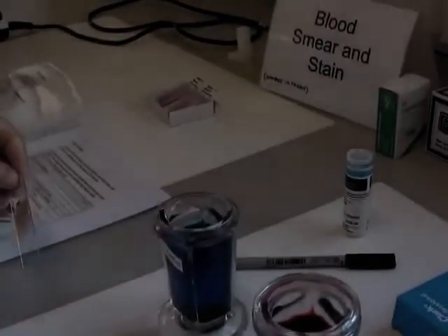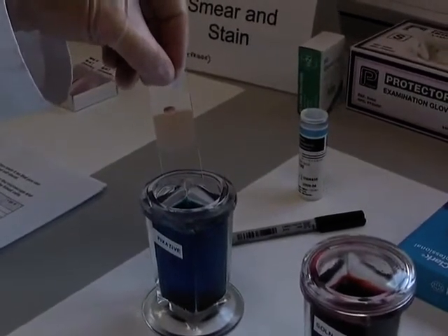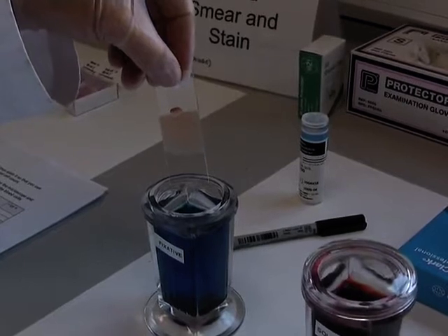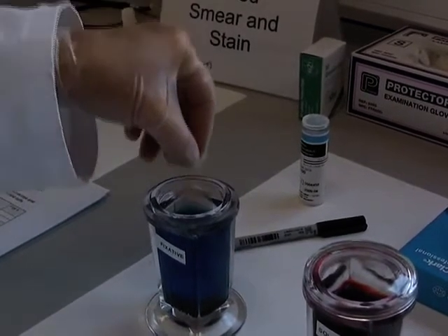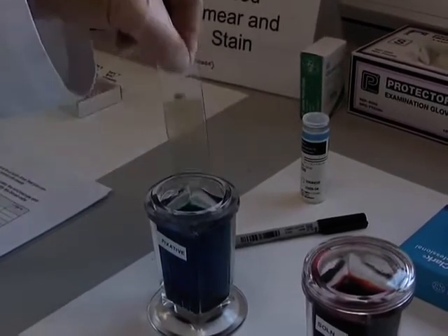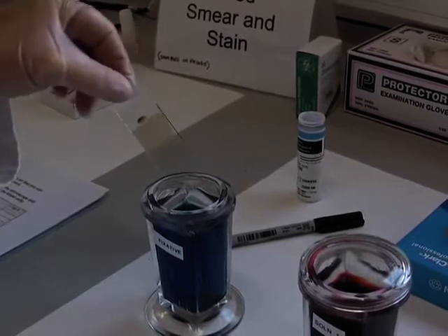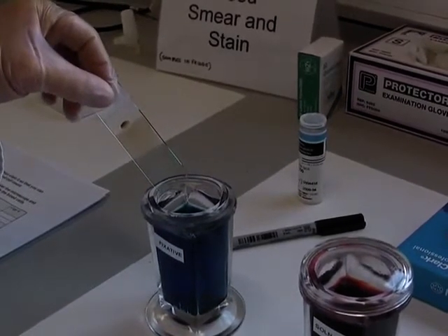Now for the staining. Dip into the fixative five times, one second each dip: once, twice, three, four, and fifth. Allow any excess to drain.